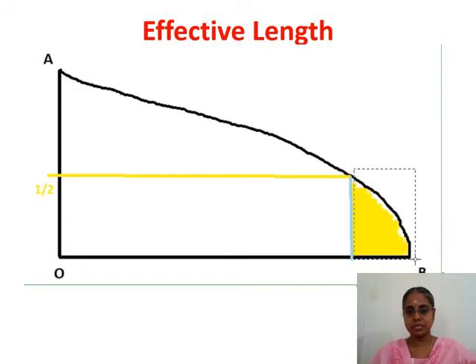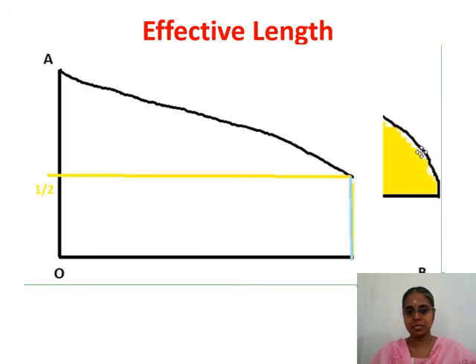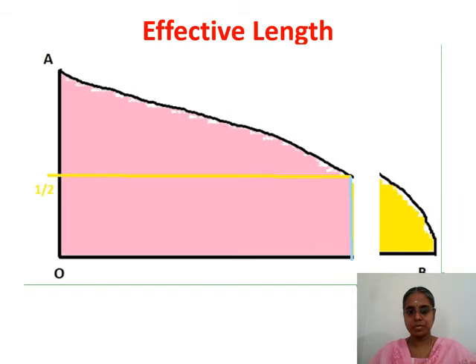Now you are cutting this part and removing. This is removed, and I'm moving it aside. Now this is taken, and you have this total weight. Consider this total weight to be x grams. Now you draw a line where the upper part is here.